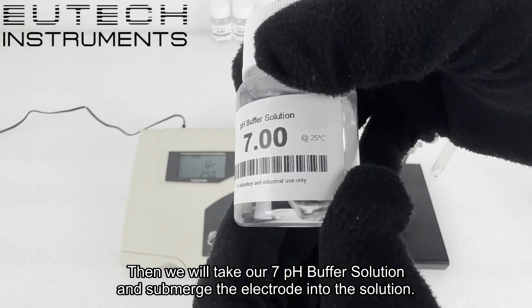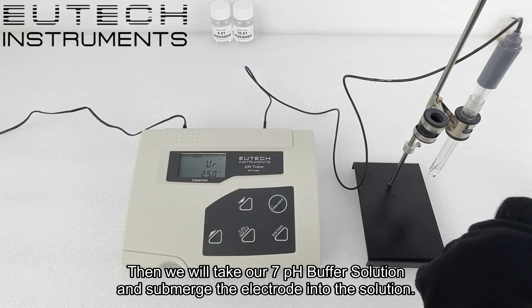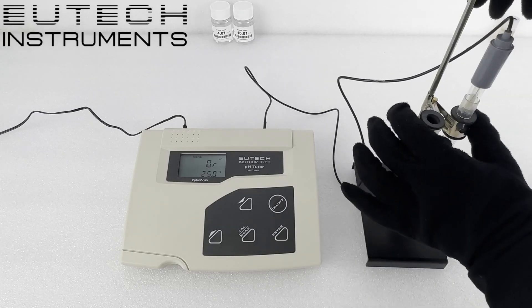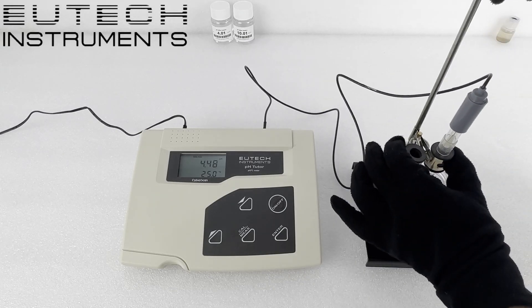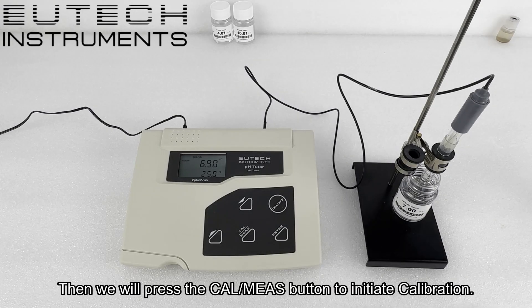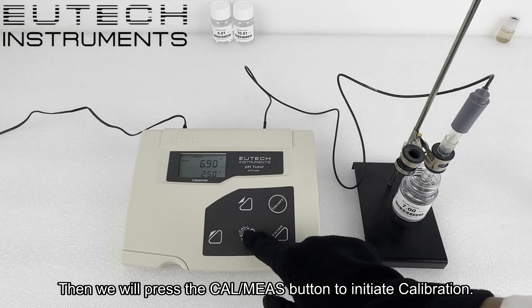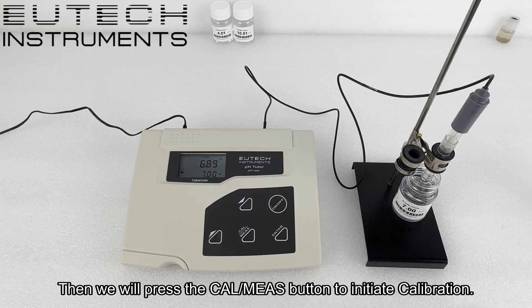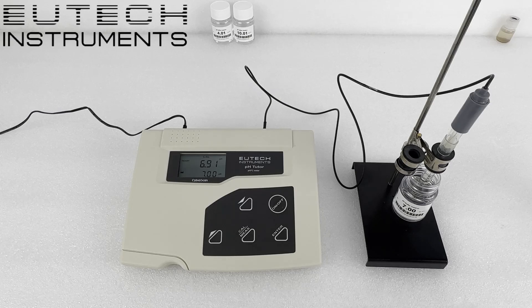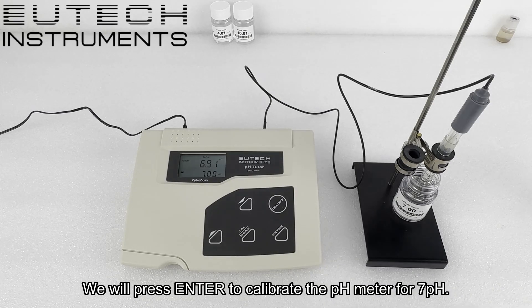Then we will take our 7 pH buffer solution and submerge the electrode into the solution. We will press the CAL/MEAS button to initiate calibration. On the bottom of the screen, 7 pH will be displayed. We will press enter to calibrate the pH meter for 7 pH.